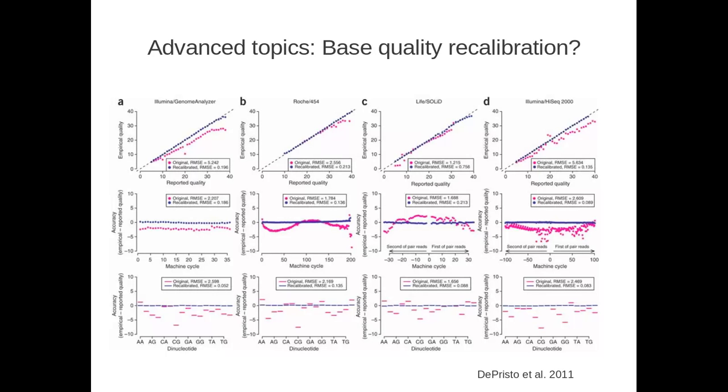And so this slide here is from a paper by Mark DePristo, the leader of the Genome Analysis Toolkit team at the Broad Institute in Cambridge. I'm not really going to attempt to explain this slide, but I have posted this paper on the course site for week 6 because I think it's a landmark paper in our field, particularly in the resequencing field of next generation sequence analysis.